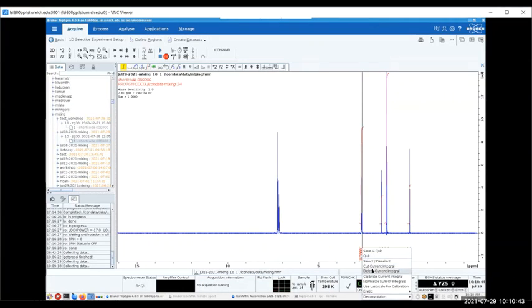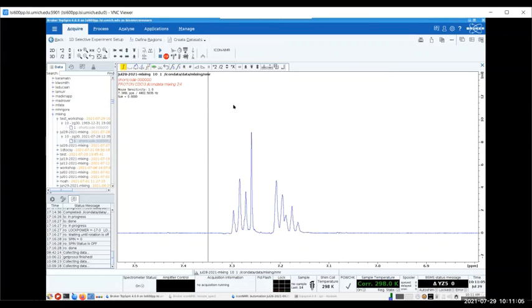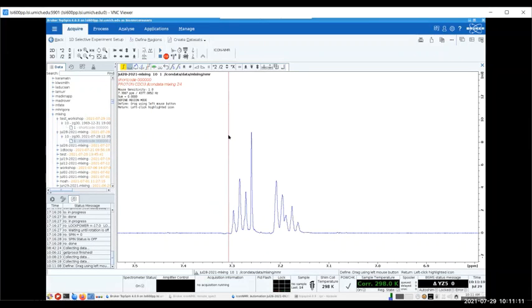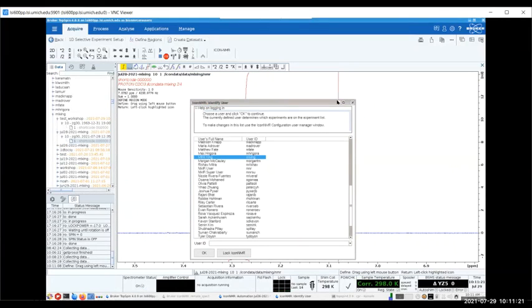And there's another way you can just delete all of them at once. So here I will delete them one by one. And now there's no integration anymore. And then I can define the region I want to excite. This kind of experiment allows you to define as many regions as possible. So we can first go to enlarge into this region, and then I click on this define region icon, and then drag my mouse, and then now this region is added, and then I know that this will automatically log me out in 2 minutes.